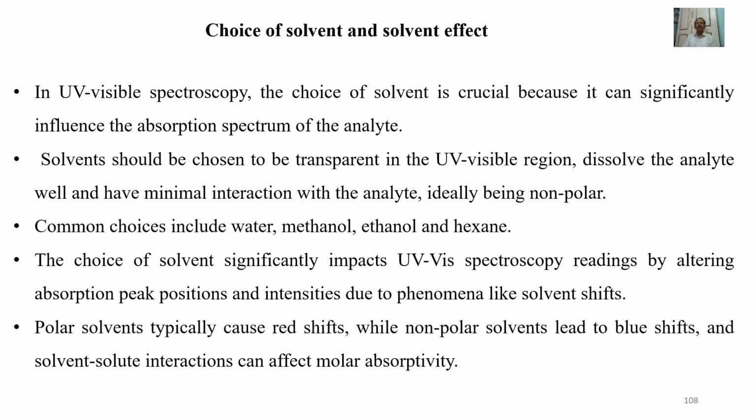Let us discuss choice of solvent and solvent effects. In UV spectroscopy, the choice of solvent significantly impacts the resulting spectrum, influencing absorption peak positions and intensities. Solvent effects arise from interactions between solvent and solute, particularly due to the solvent's polarity.